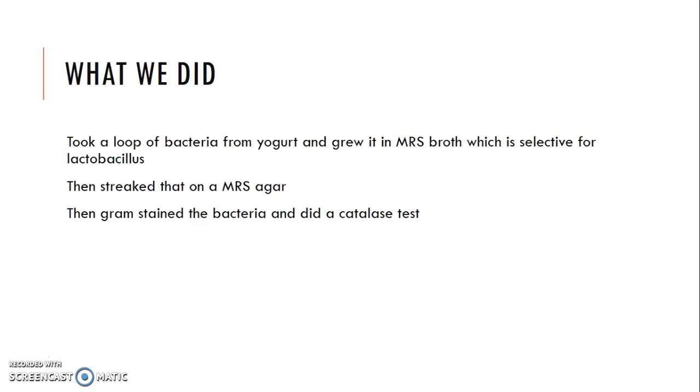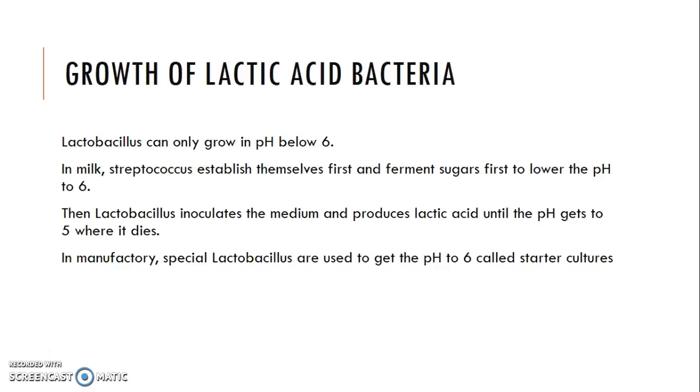It's a similar thing in that you're taking microorganisms from the dirt, mixing it with a broth, then taking the microorganisms from that broth and putting them on a plate. Same thing here: taking it from yogurt, taking it from the broth, and putting it on a plate. It's a way of purifying your culture of the things that you want to specifically select for, while getting rid of all the yogurt particles or dirt particles or whatever it may be. Then we gram stained these bacteria and did a catalase test to indicate if they're Lactobacillus. So it's a relatively straightforward experiment with regard to isolation.